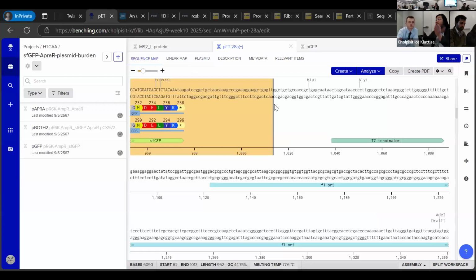Since we're doing the synthesis anyway, adding 5 or 10 bases, or let's say 20, doesn't cost that much compared to the thing you're trying to synthesize. So make sure if you want to do anything downstream, it's better that you don't have to do another PCR round. Try to take advantage of the synthesis so that you can go faster.